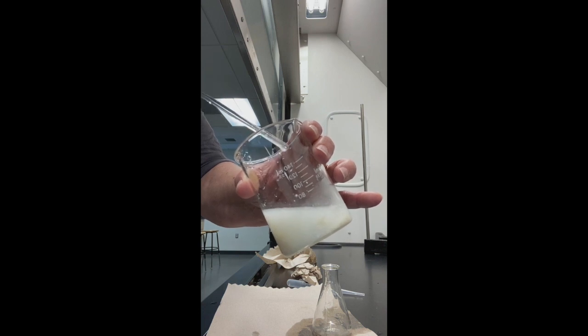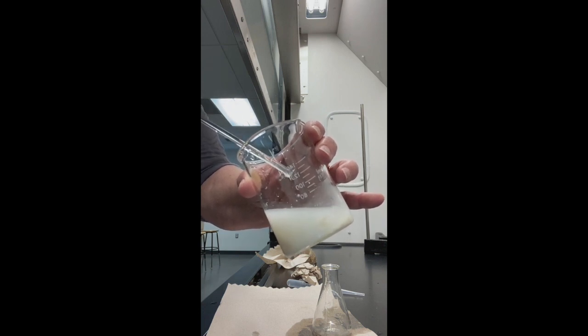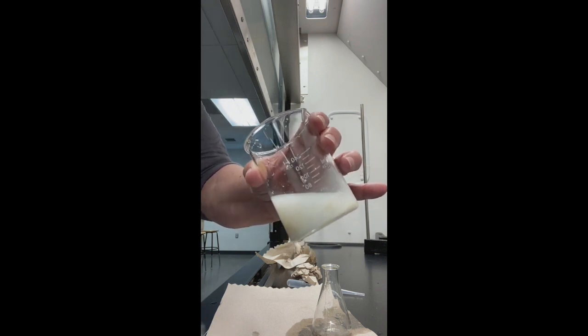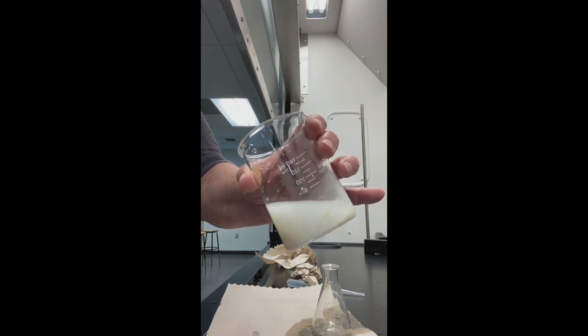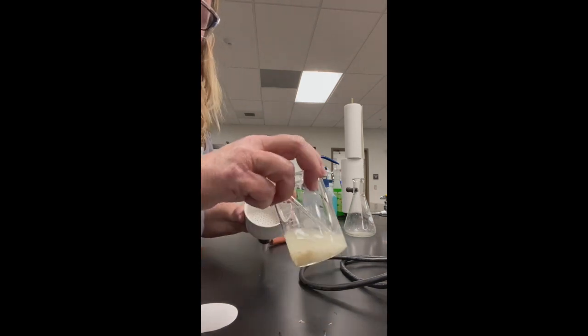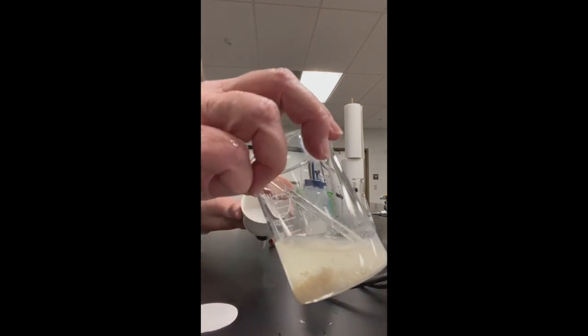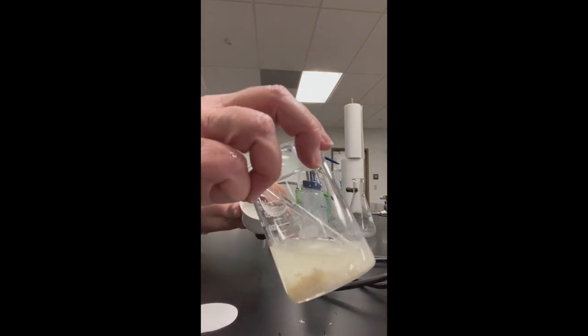Our next step is to recrystallize these because these are crude crystals and we need to make them nice and clean and pure so we can take a melting point. Now I do have my solid and the amber color is gone. So it didn't make any difference that that was there.